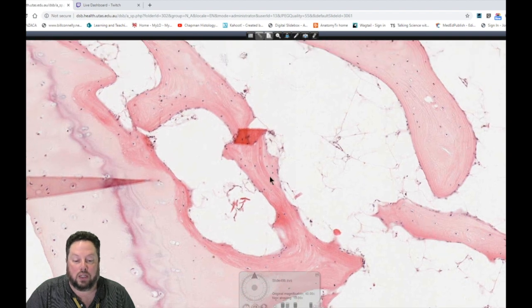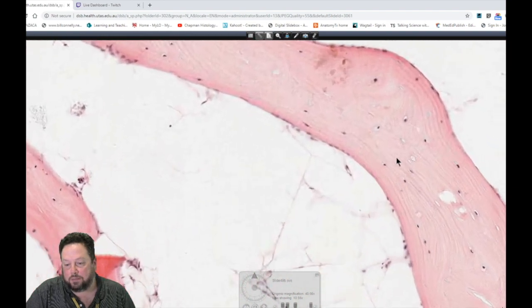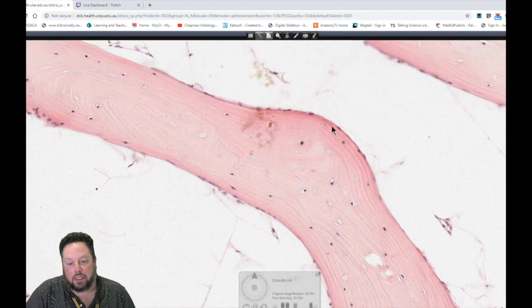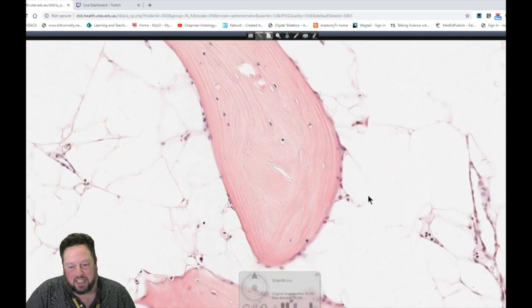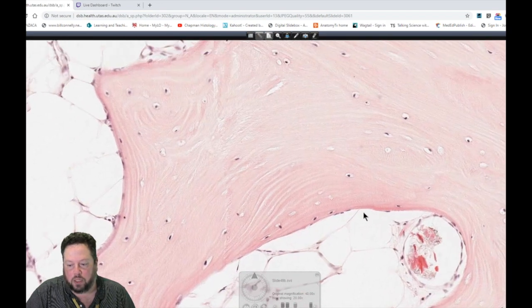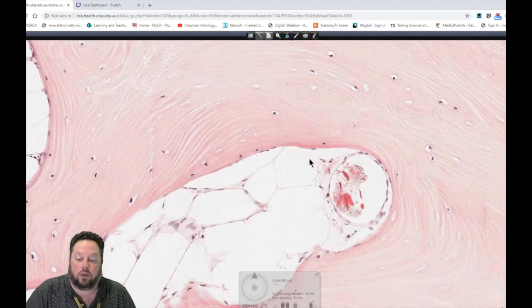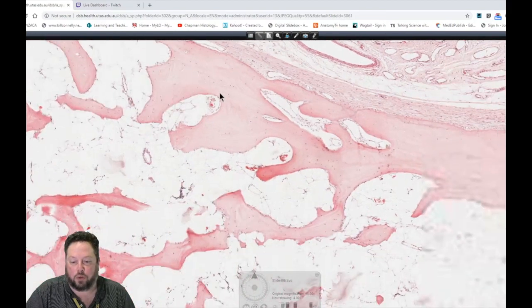These are the bony spicules. You can see sometimes the orientation of the lamellae here. These are nice, look at this. These lines forming here. Here are our osteocytes within their lacunae. On the surface we have our endosteum with our osteoblasts and osteoclasts and osteoprogenitor cells. Again, you may need to do a little bit of searching around to get a nice section of that. You can see some of them out of plane of section. But again, there are no blood vessels within the spongy bone. They're all on the periphery. Diffusion is working through these osteocytes, forming those canaliculi, those cytoplasmic processes and so on.